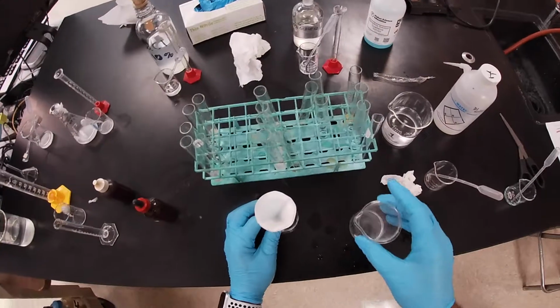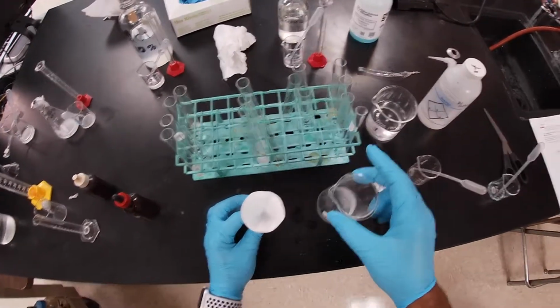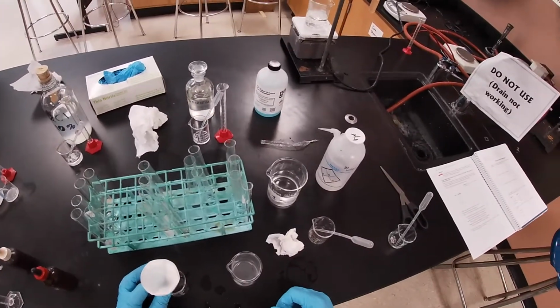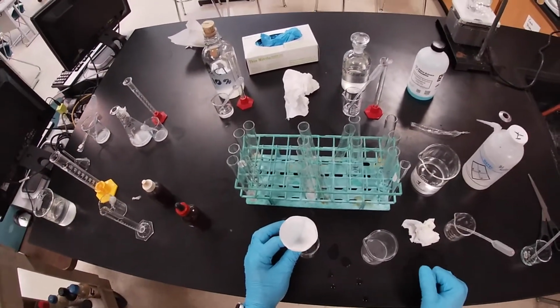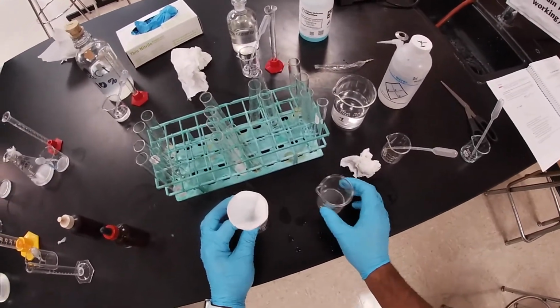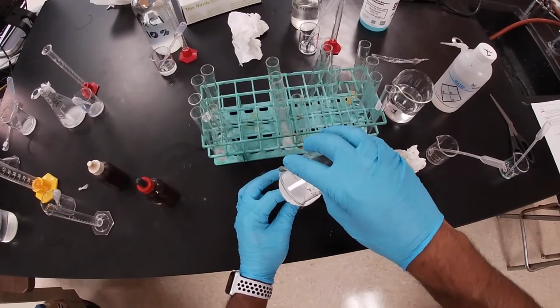And so the last thing that we're going to do is we have our last content. It asks for 15 milliliters, but there's no way you're going to get 15 milliliters when they initially only tell you to pour in 20 milliliters and then you test 15 of it in the previous part. So whatever we have left, that's what we're going to work with.